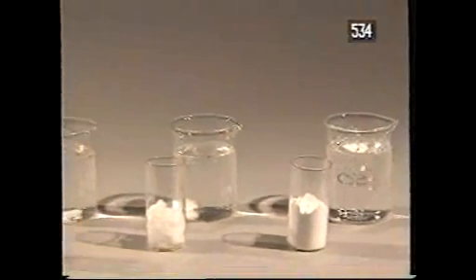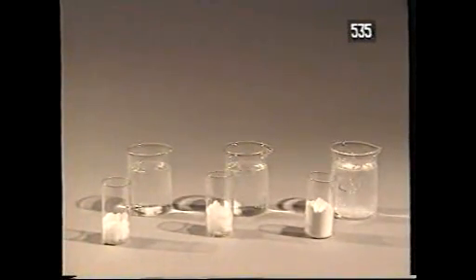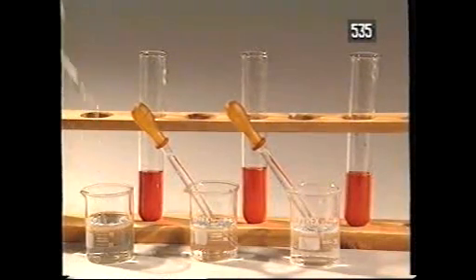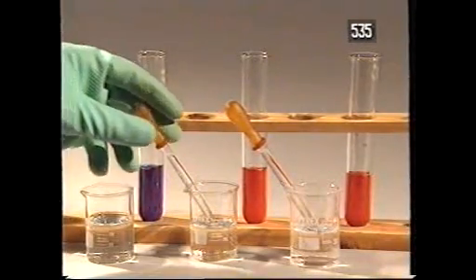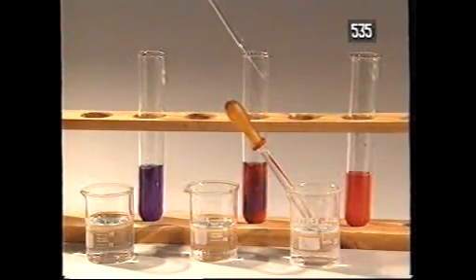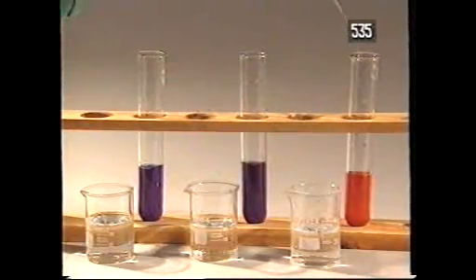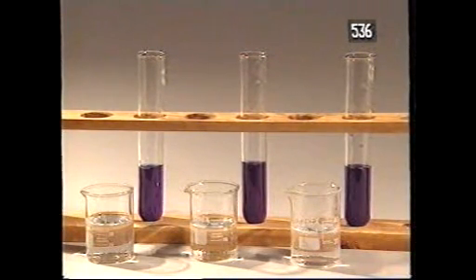All three of them eventually dissolve in water. Now let's add the three solutions to litmus: sodium hydroxide, potassium hydroxide, and calcium hydroxide. All three solutions turn red litmus blue.